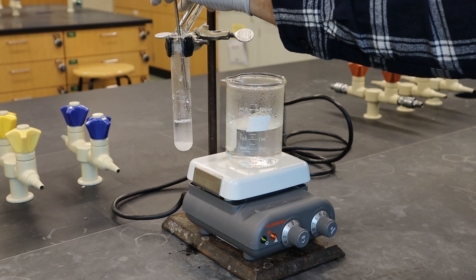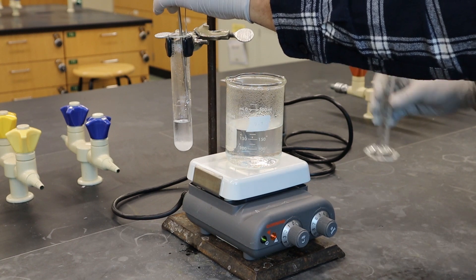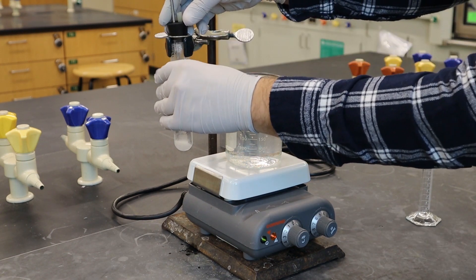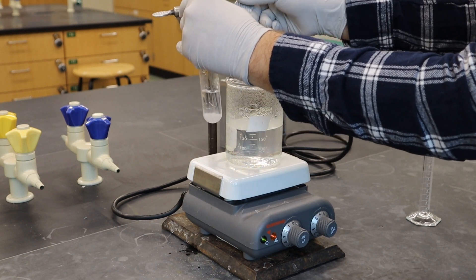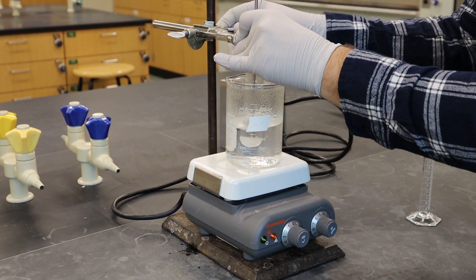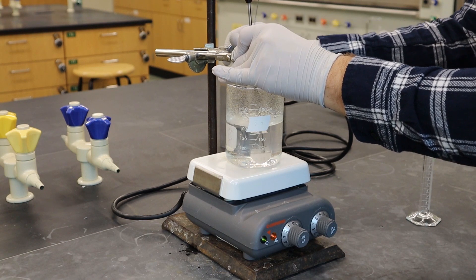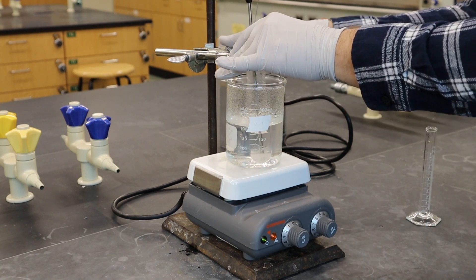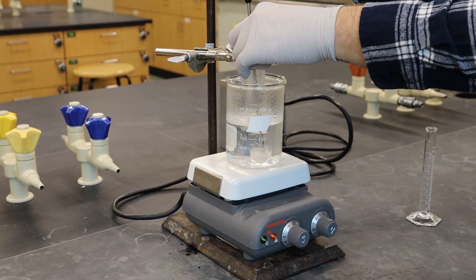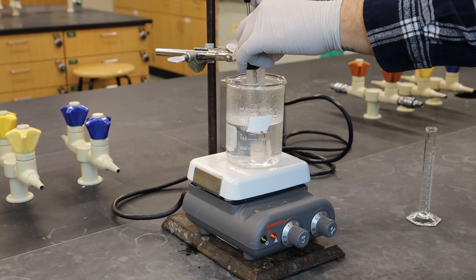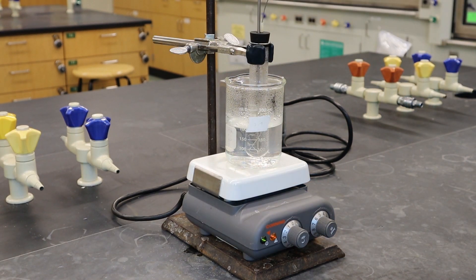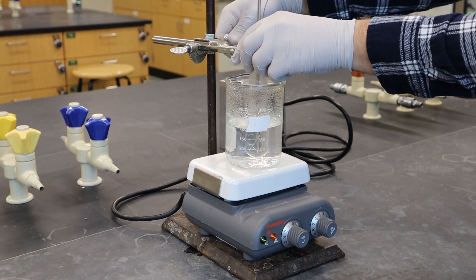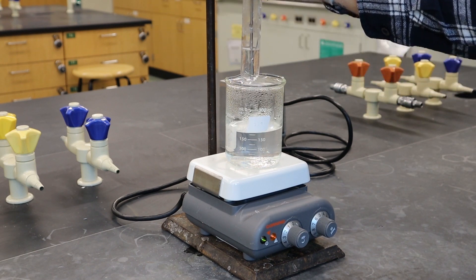So now you add more water, redissolve it again, and do the same thing. And so you're gonna get a series of saturated solutions at different concentrations because you're measuring them at slightly less concentration every time that you add more water. And you're then going to measure the temperature that you start getting the solid to form again. And so that's going to be a different temperature at each one of these different concentrations.